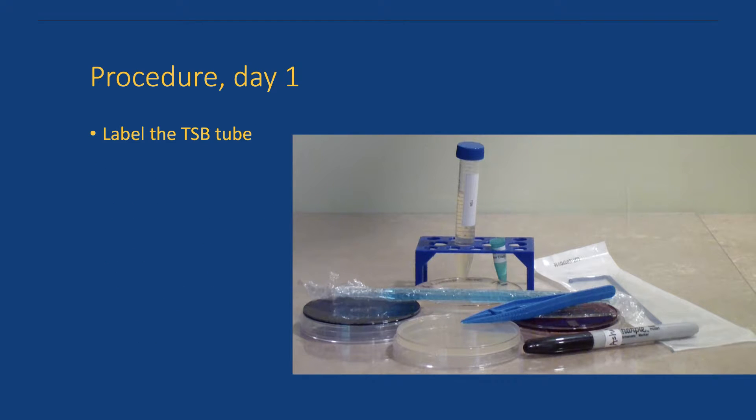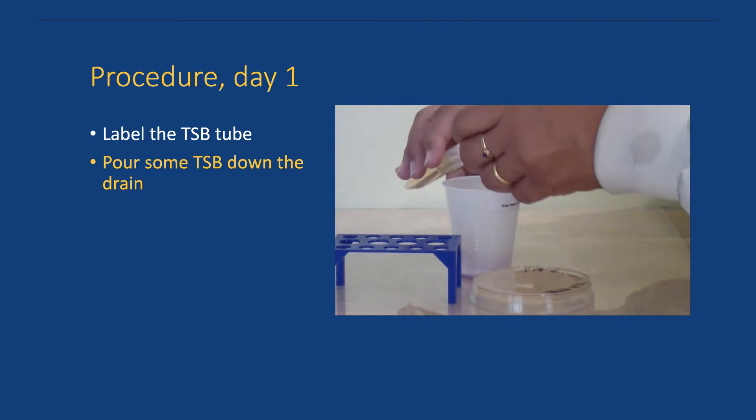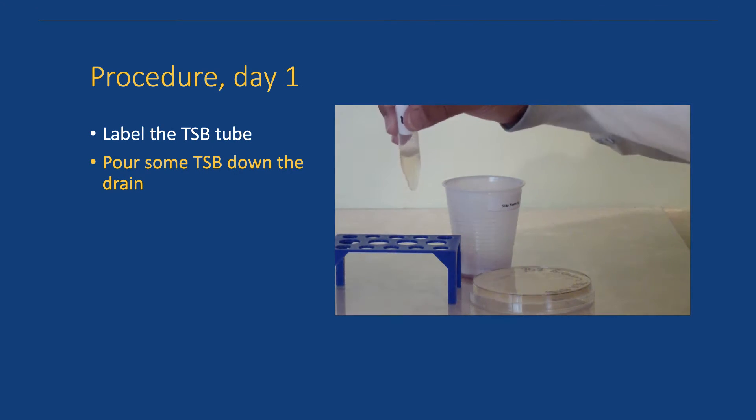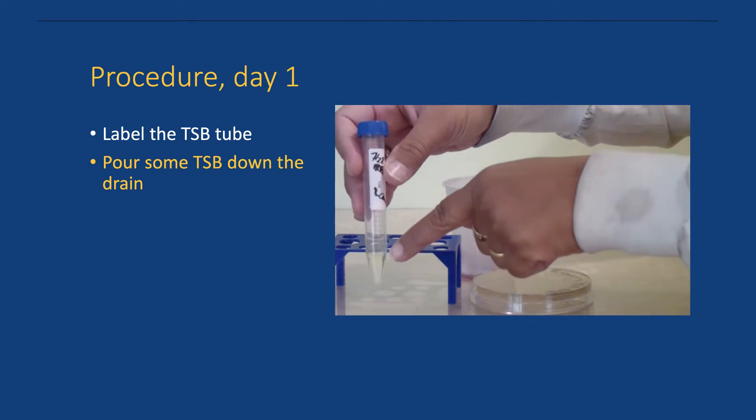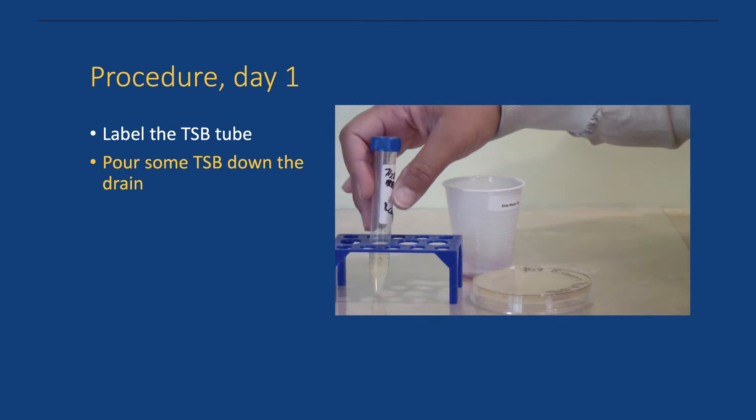On the first day label the TSB tube with the required information. Discard some of the TSB down the sink drain. You only need about two to four milliliters of TSB. The exact amount isn't that important. The broth is sterile so it can just go down the drain.